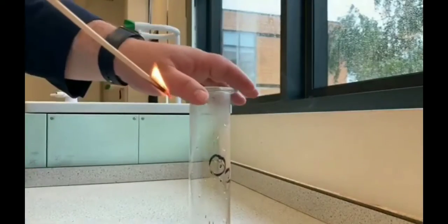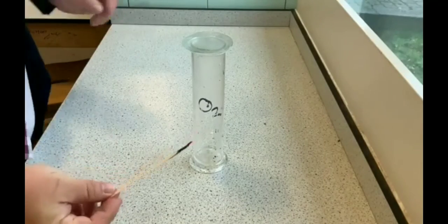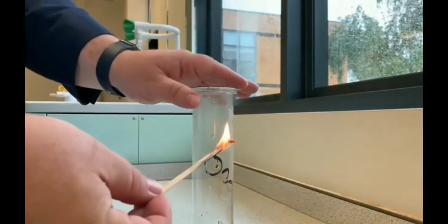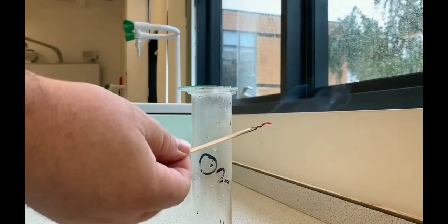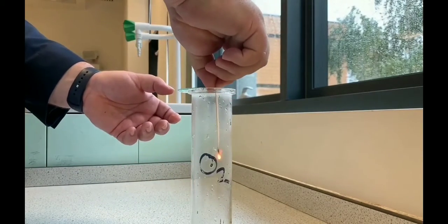As you can see here, I've got a gas jar and I've got a burning splint. Well, the test is that if I put a glowing splint into oxygen gas, it should reignite it. So let's have a look at that again. I've got a glowing splint, the flame's out, and when I put it into the oxygen, it should reignite.